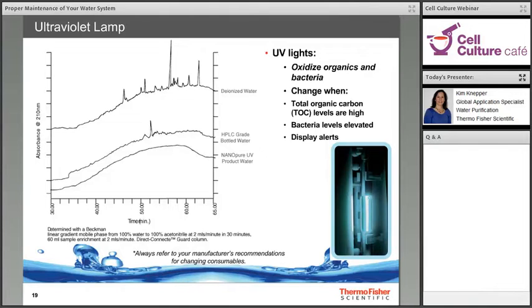should be replaced in units that have a TOC readout. So always check with the manufacturer instructions to be aware of how your particular system signals you to change that UV bulb.